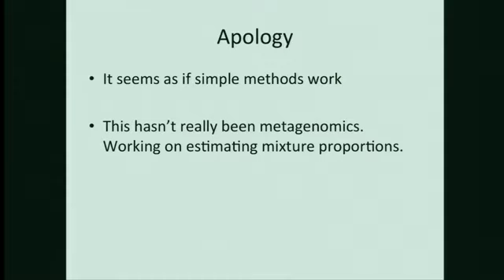On the other hand, when it does happen, there are situations in staph where the major population is not drug resistant and the minor population is. And so there are situations where you're very interested in those mixtures, and that's the kind of thing I'll be working on in the near future.